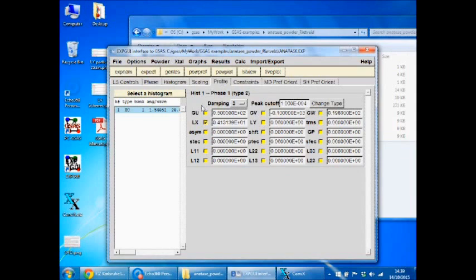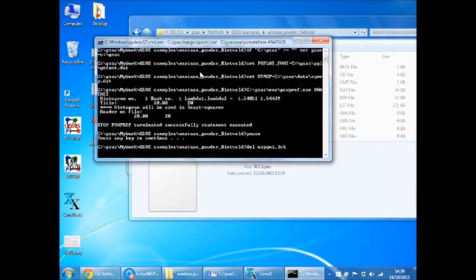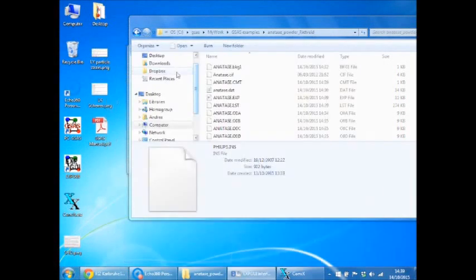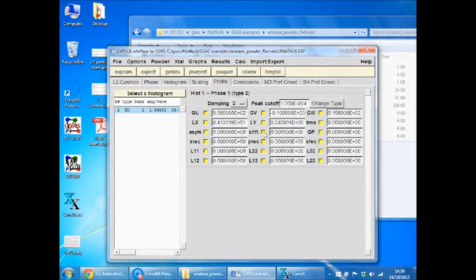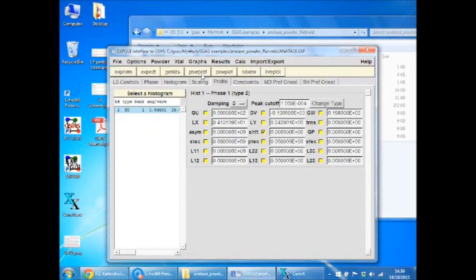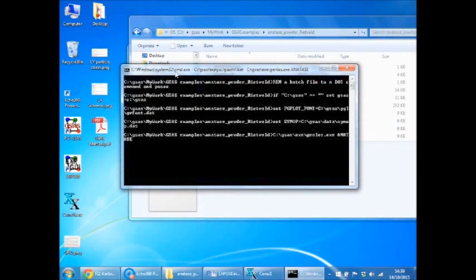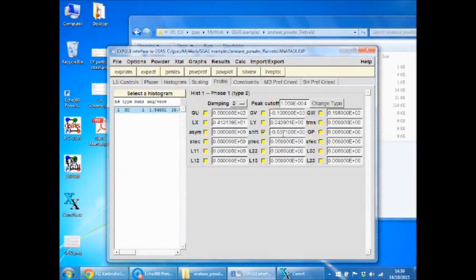So there are other sort of fudgy things that you can do to try and improve that. So let's just try changing the strain. Perhaps the strain is causing an issue, I doubt it. It's not strain. Maybe there's a slight error in the measurements, it needs to be shifted. Again, that's not the issue.